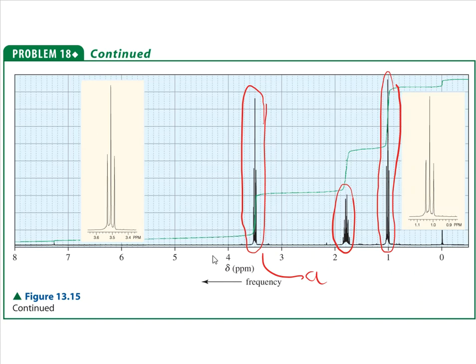And that chlorine, because it has a higher electronegativity value, exposes the proton even more to the magnetic field, and that gets harder to flip and provide a signal versus the iodine version that I might have in the other example.